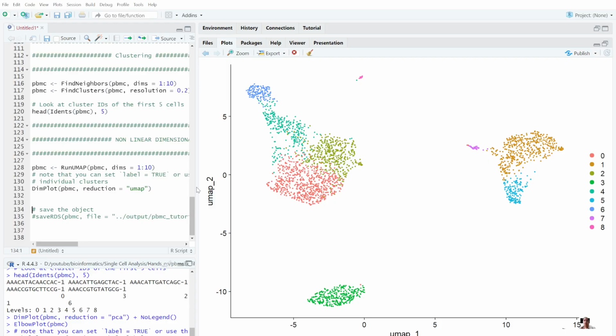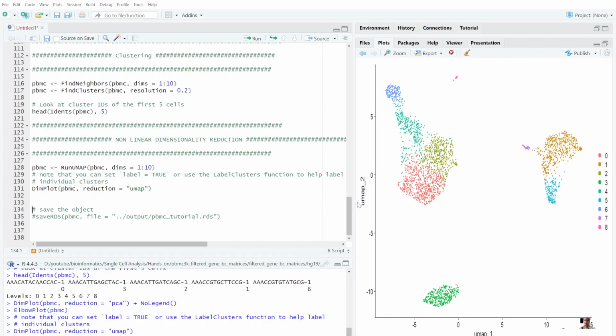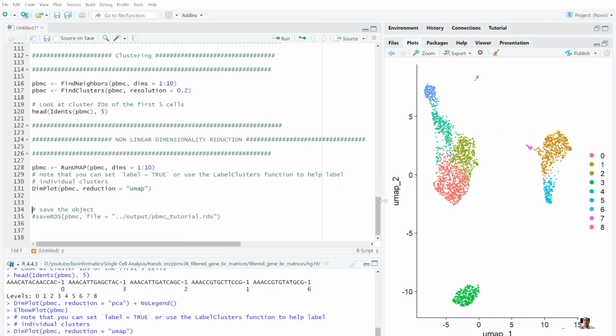reduction known as UMAP. So UMAP one, you can say, are the set of features that has more variance. You know, the 1 unit distance between UMAP one gives you the most variance when you compare to the 1 unit distance between UMAP two. As I've already explained to you in the PCA, the same logic goes over here also, right?